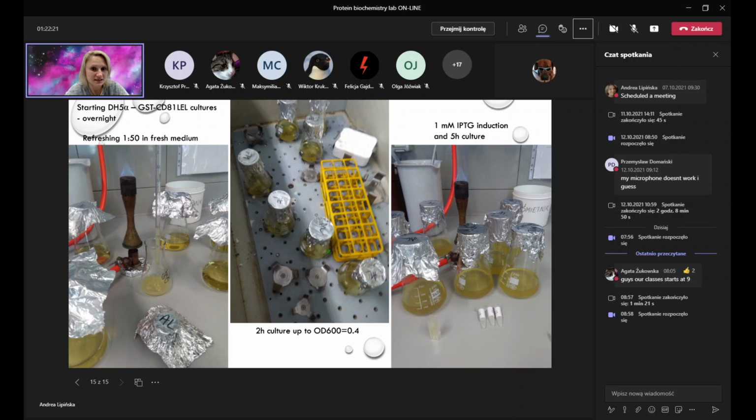Okay, so are there any questions that you have about the lab? You will use different compounds for the lysis, so please pay attention to why you need magnesium chloride, why you need DNase, why Triton X-100, what your beads for affinity chromatography are, and what we are using for elution later on, but this will be next week, so not this week.